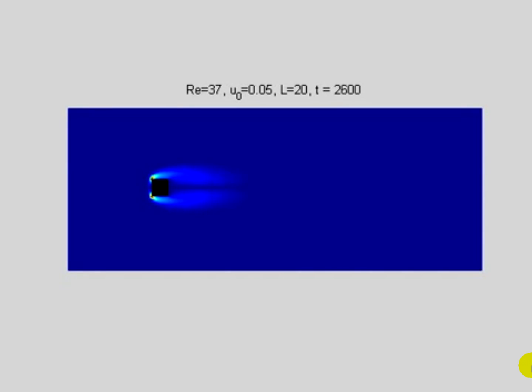So if this is a photobioreactor, for instance, remember that when you have vorticity, shear stresses are very important. So if this is a photobioreactor, any cell that passes through these red regions may die because it will be torn apart by these regions, okay?